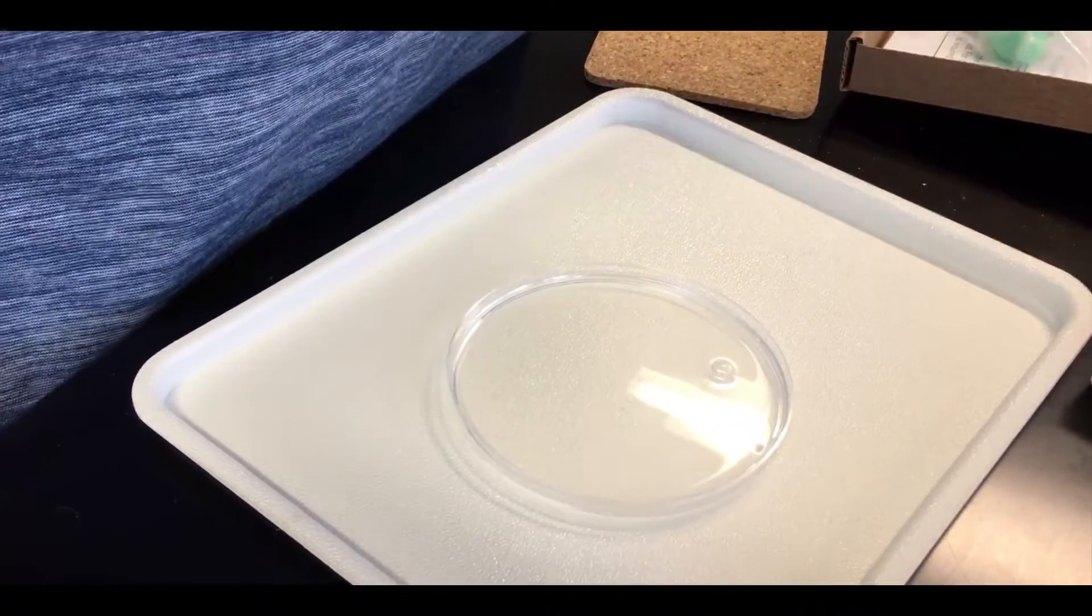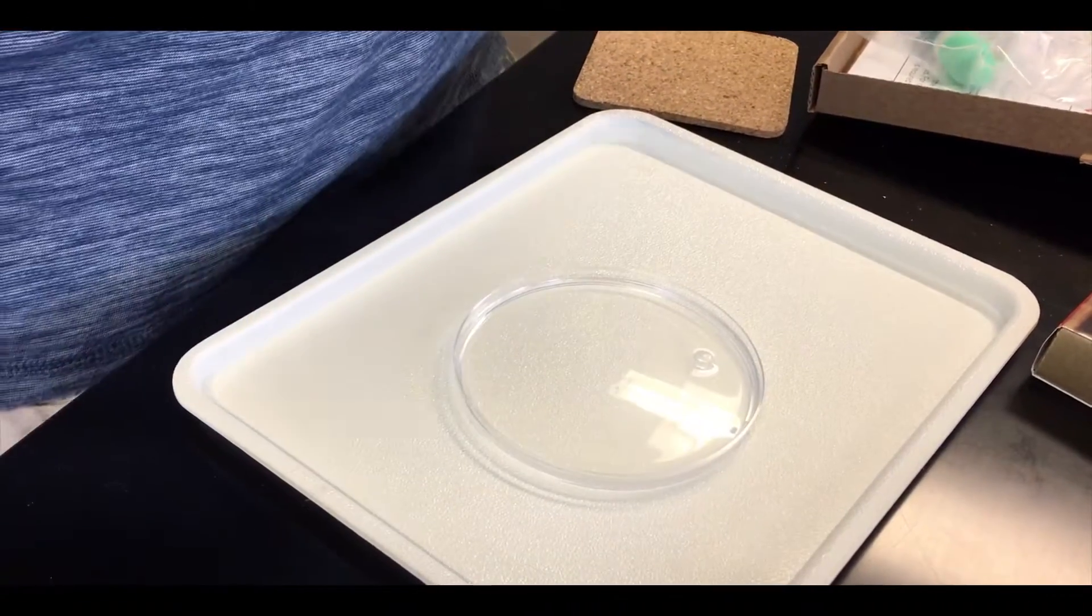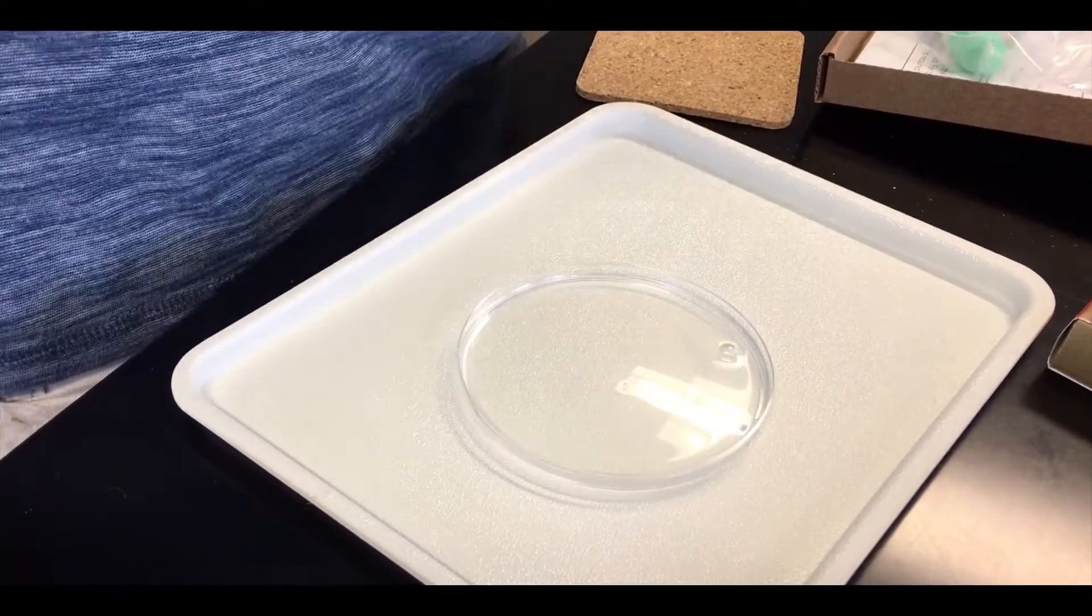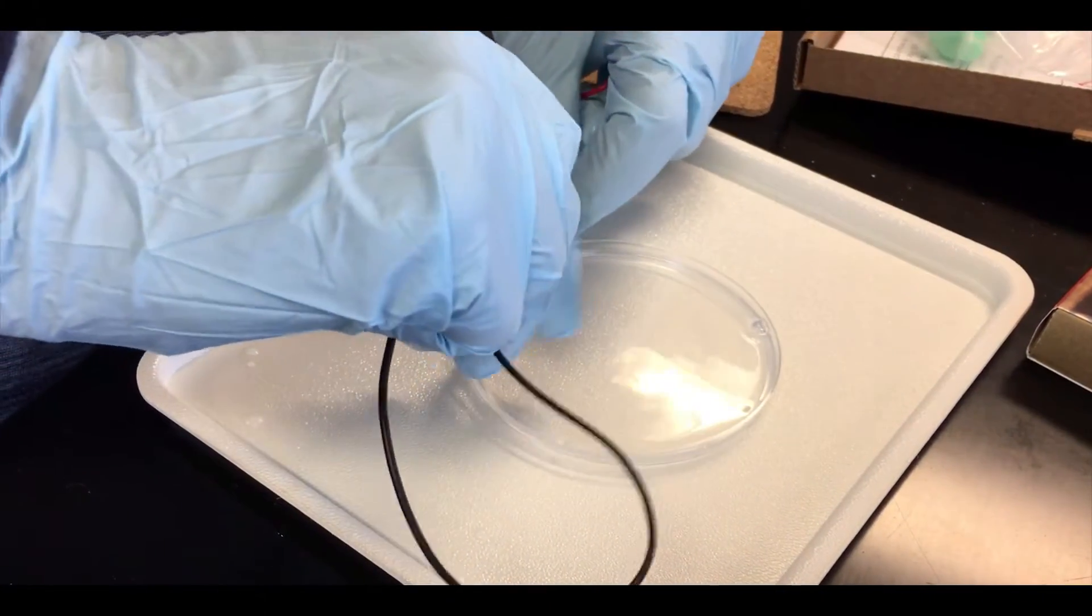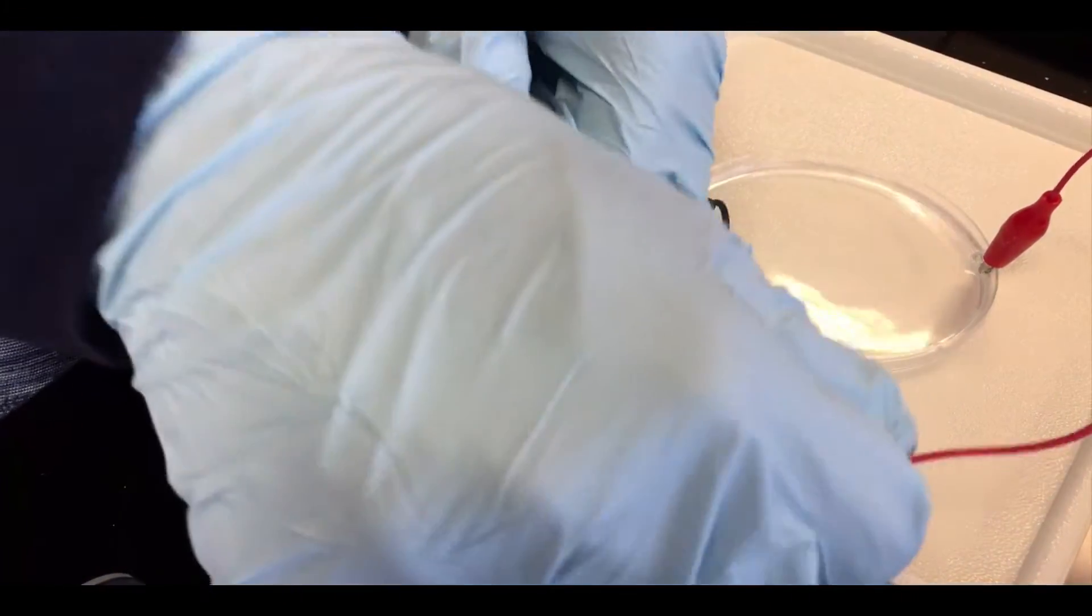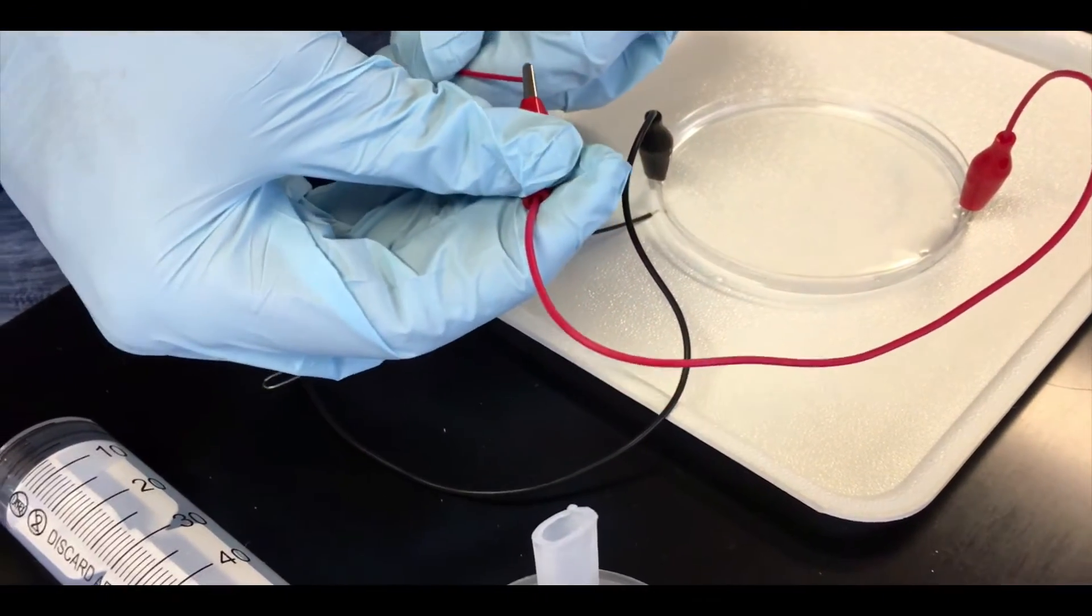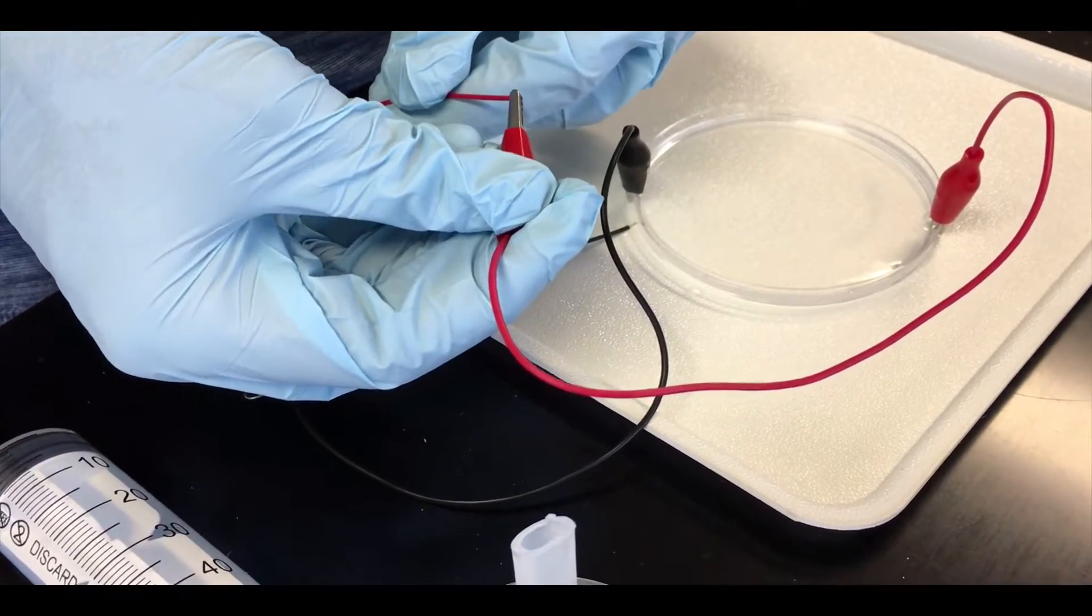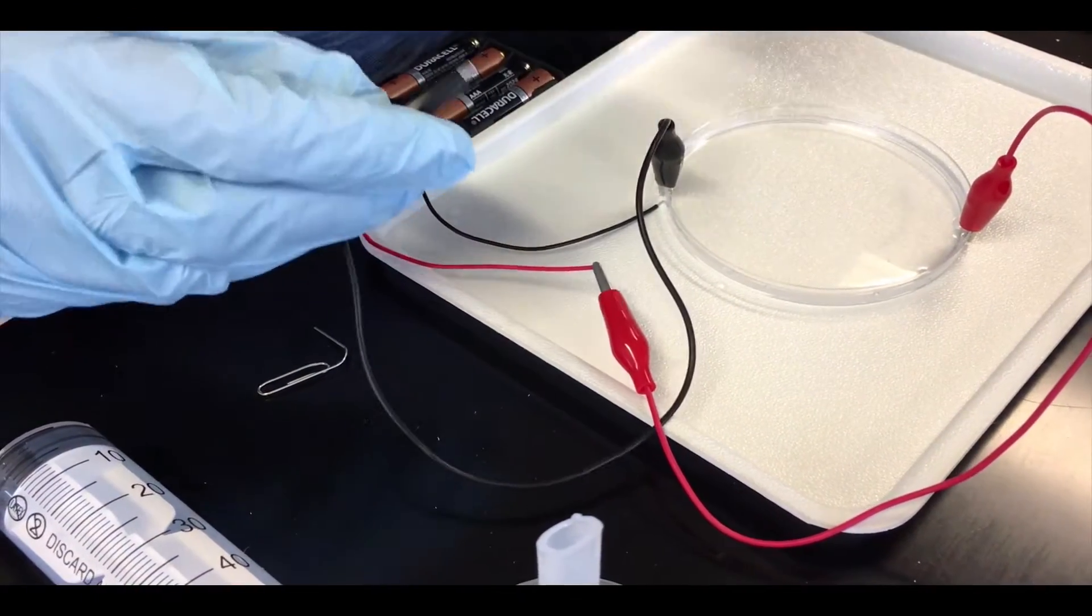And now we have alligator clips which are going to allow us to connect the battery to the water. We're gonna match the colors up. You don't really have to match up the colors, but this way we'll know how electrons are flowing. A wire is a wire, but why not match? It looks prettier that way.